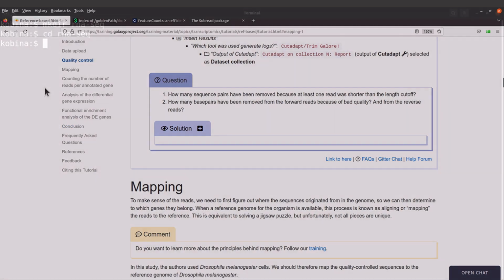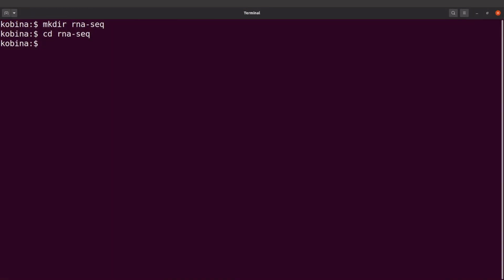So first of all, let's go back to the terminal. And then on the terminal, we are going to create a script. And in that script, we will place all the links and then execute that script. So we will do a batch download here. So I'll say nano download_data.sh. I'm using nano, but you can also use vi or any text editor for that matter. So take note of that.